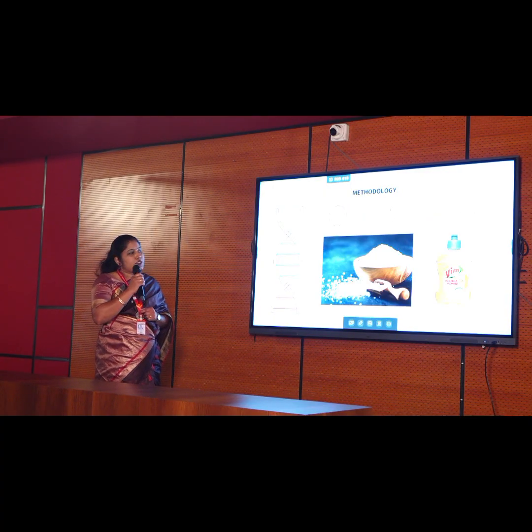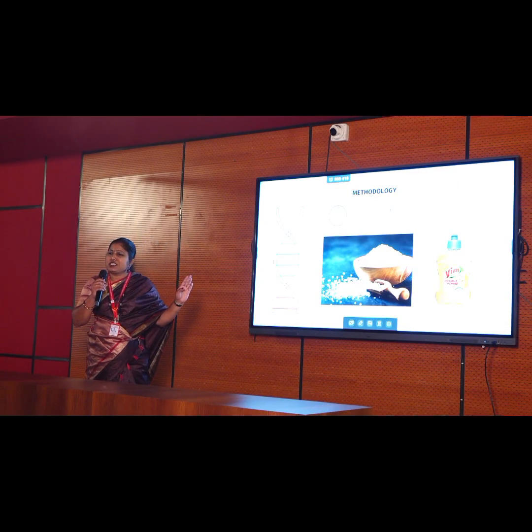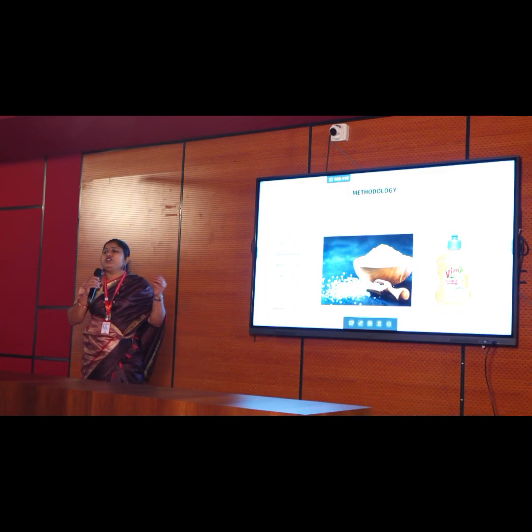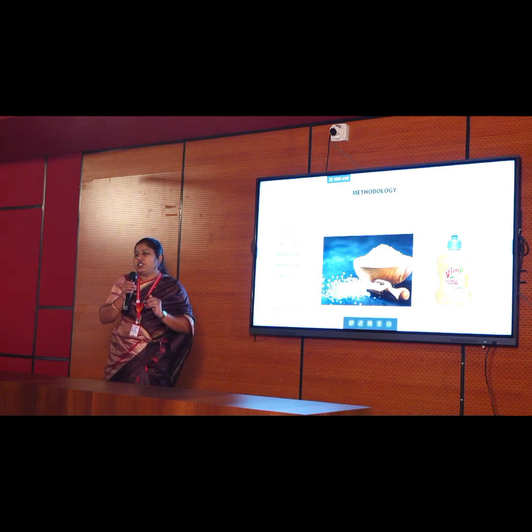Reagents, as I told. Two reagents we have used: just a simple liquid soap or detergent, which is available in your homes, in your localities, in your kitchens, plus salt. These two reagents are easily available at hand, so there is no need for prior setup a day before. It is instant, in 10 minutes you can set it up and go for extraction of DNA.